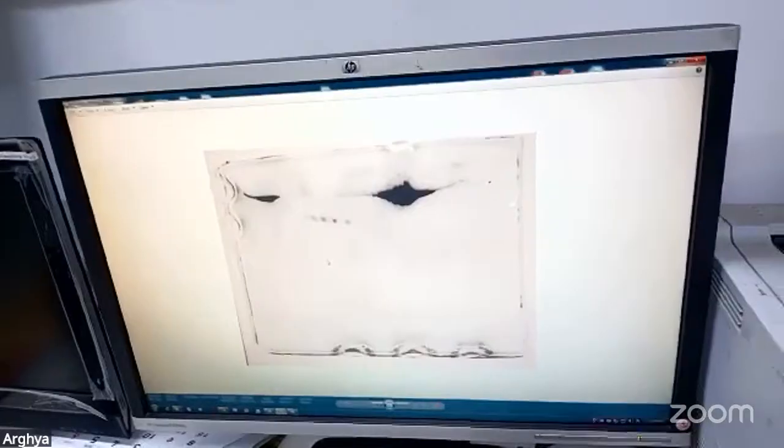At the end, you sometimes get gels like this, which is not so great. You have a lot of abundant protein here. Albumin is probably seen on the gel from the serum sample, which means it is masking everything else. But even this gel is giving you interesting information that there is a depletion requirement, because this highlighted part has the blob of protein, which means a lot of albumin and IgG, etc. So you need to clean up these samples and deplete those to ensure that you have sufficient quality of the proteins.